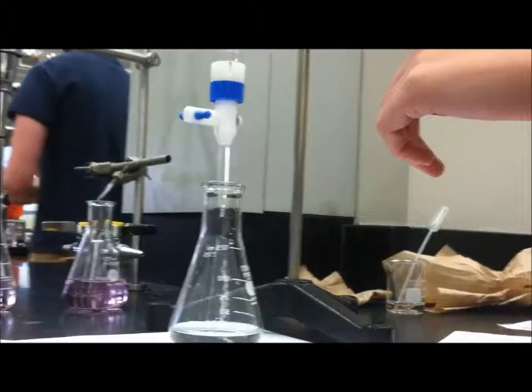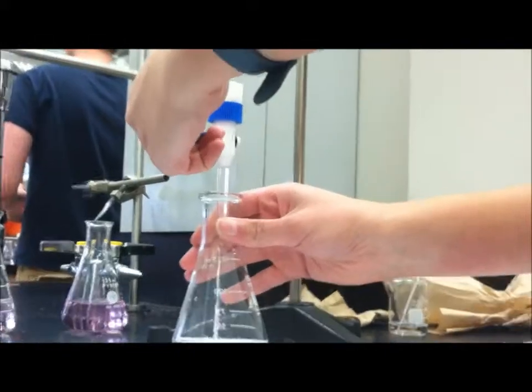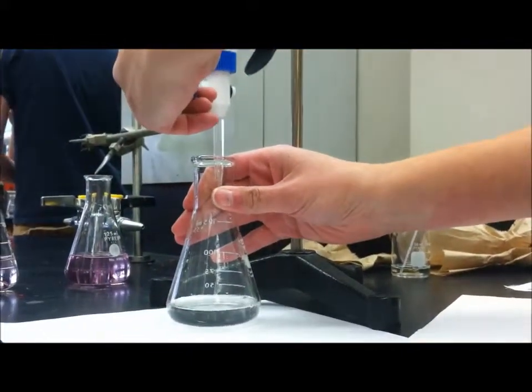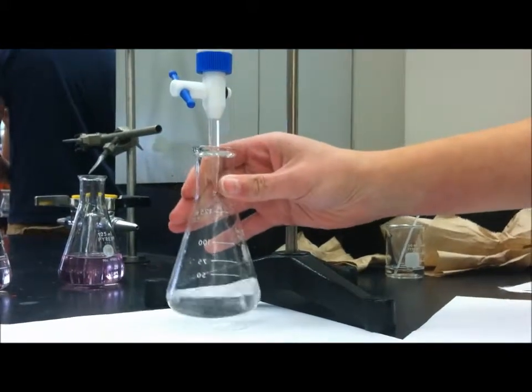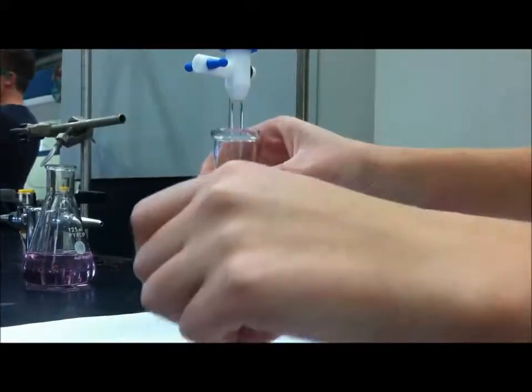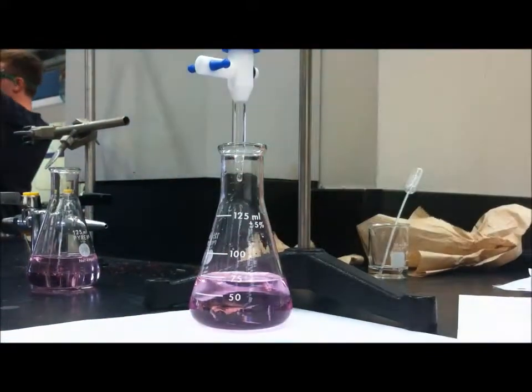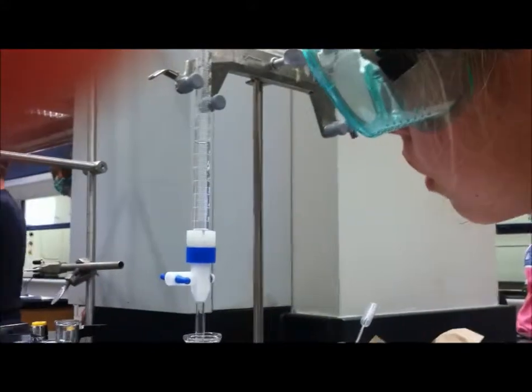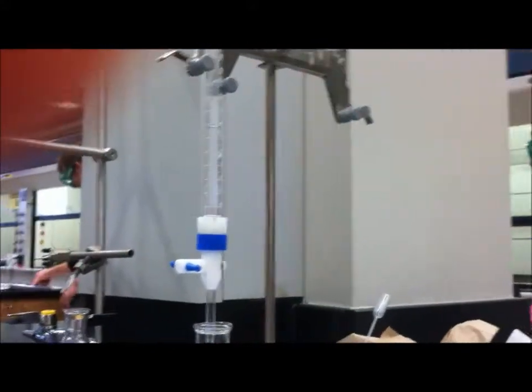The initial volume for our third trial is 0.0 milliliters. I'm now going to slowly add some of the solution to our flask. I'm going to swirl it around as I do it to mix it. And we have now reached our end point, and our final volume is 44.10 milliliters.